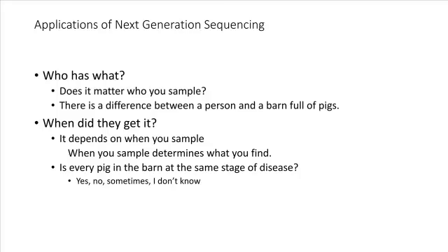And so again, sorry, say again? Oh. So, yes, no, sometimes I don't know. Probably I don't know is the more common answer because, as Obert related with sequencing curves from normal or not clinically severe pigs, we don't know what normal is. So if we don't know what normal is, we can't do any comparisons.